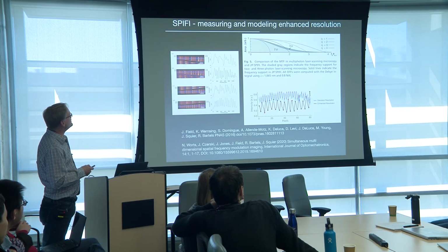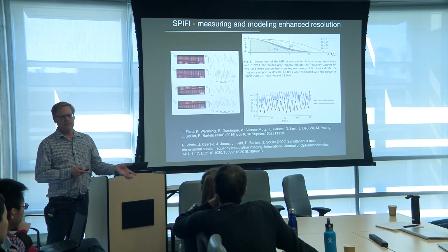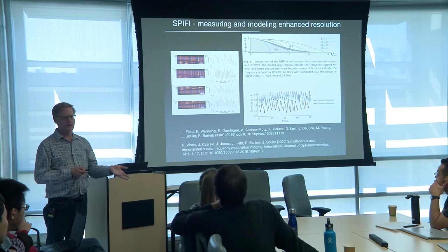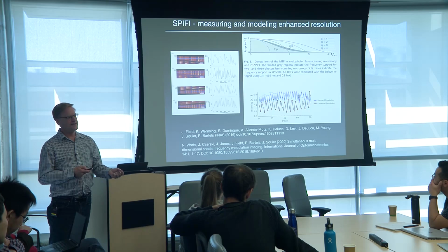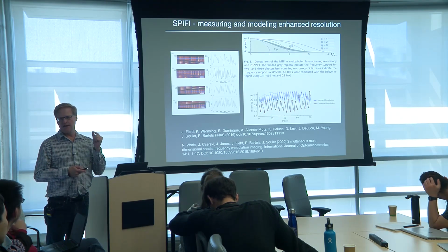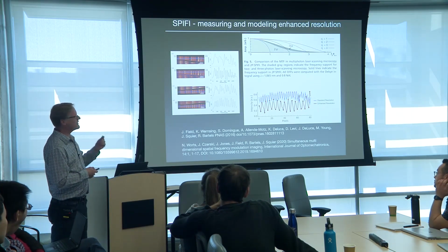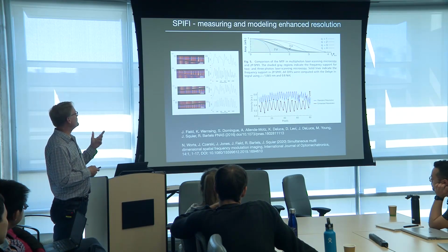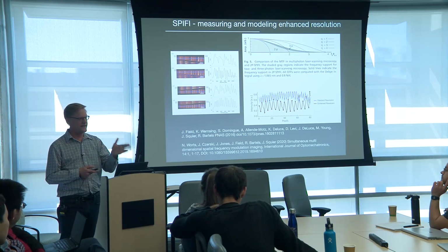Yeah. And then we go through it. The way we've done this is we've measured with fluorescent particles that are way below the spot size. We've used fluorescent spheres, we've used fluorescent nanodiamonds. For second harmonic, we've used small barium titanate crystals to do this. And then for just pure linear imaging, we can actually use linear or Air Force targets.